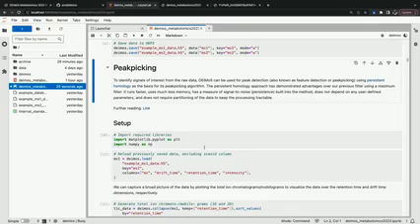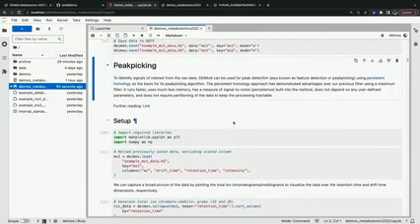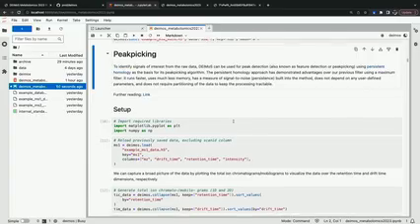We've seen that persistent homology does a good job detecting the features in the data versus other approaches such as local maxima filters that we've used, as well as scaling really well to large multidimensional data sets, such as the ones we process at the lab. For instance, our peak picking algorithm on this data file, which you can see is quite large and takes a while to load, takes a matter of seconds. And so we're hoping we'll demonstrate that in a bit once the data has loaded.